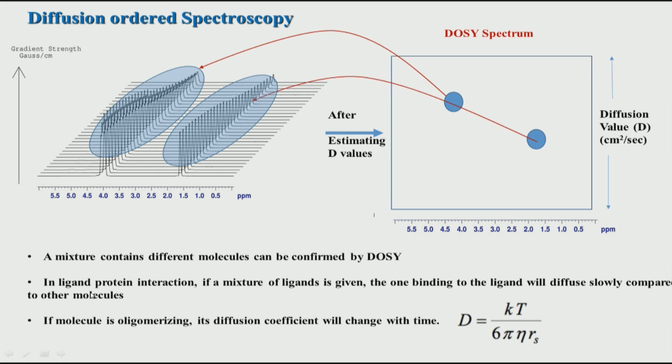This is a typical strategy followed when we try to screen a large number of compounds in the drug discovery process, where the compounds come from a huge library but the protein target is known. The goal is to find out which of the ligands or molecules bind to the protein. This is also what we call affinity NMR.